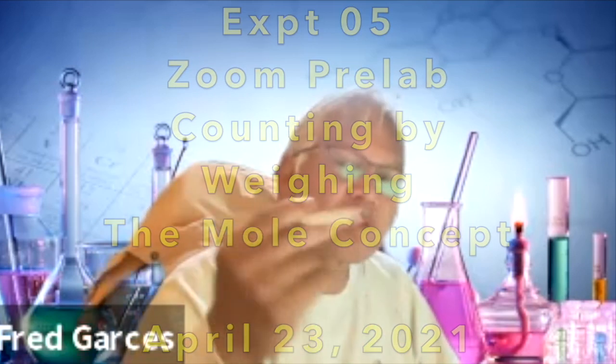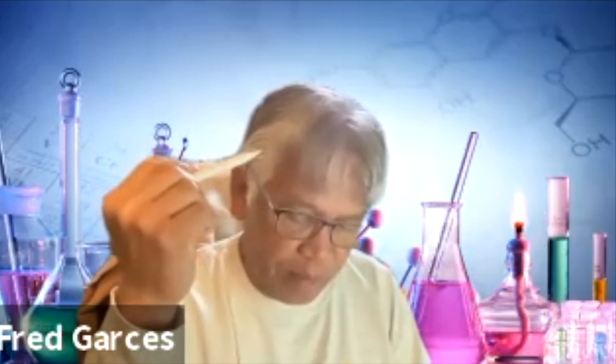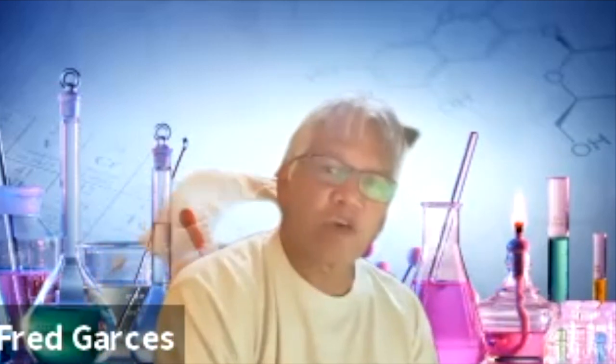Let me walk you guys through this lab. There were some modifications done, and you might still have the old version. The old version dealt with lentils and soybeans. We found out that those things are not very stable. They pick up moisture, and the mass changes. And so we had to change that experiment.